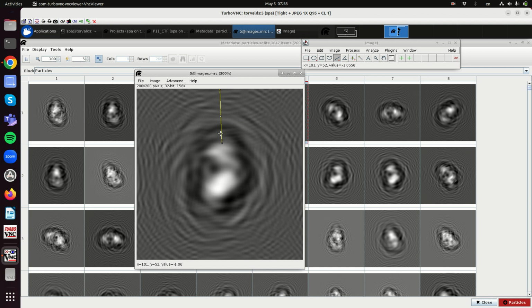So you should have your particle and around 80 angstroms around it to fully contain the information from a given particle. If you don't have these 80 angstroms around in each direction, then you are losing a bit of your information, and your 3D reconstruction will not be perfect.